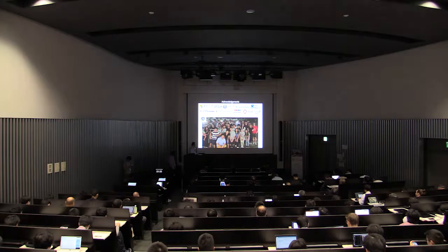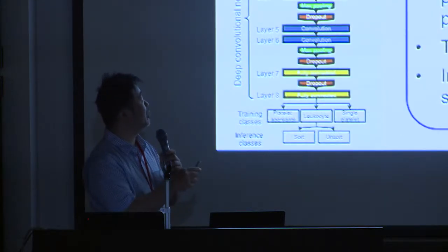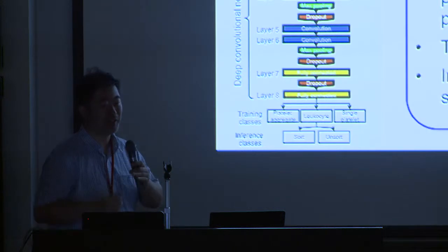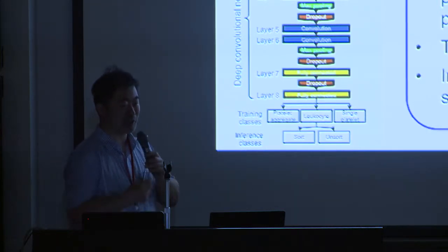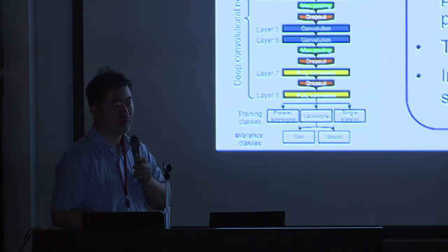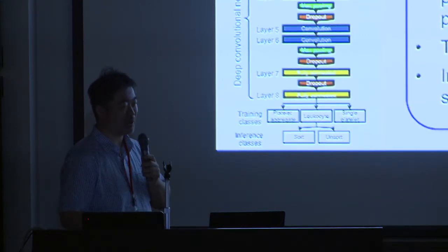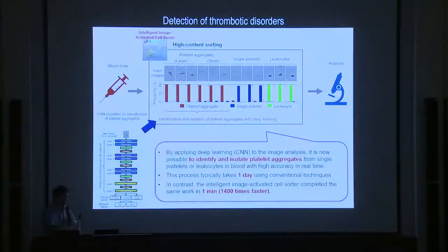No, actually, we try platelet aggregates. Platelet aggregates are basically aggregates of cells. Ah, I see. So for example, these are cells, but aggregated. And we image those aggregated or clustered cells, and then we only isolate those clusters. How long does it take to fill up a tube? From the start, it takes about 1 minute. You insert the tube, and the machine sucks up the liquid, and it's about a few minutes from the tube to the microfluidic chip. Everything can be done within minutes, less than 30 minutes.